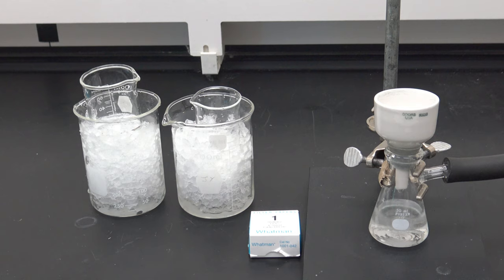We're not going to isolate our salicylic acid right now. We're going to actually skip the weighing steps and drying steps, and we're going to go on to recrystallize it to purify it and then isolate it and dry it to constant mass. So we'll just leave it here for approximately 5 minutes to help dry it.